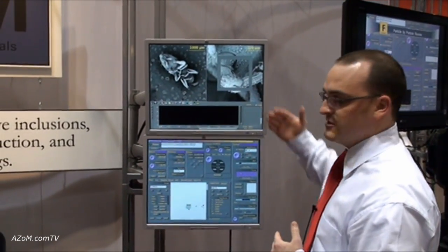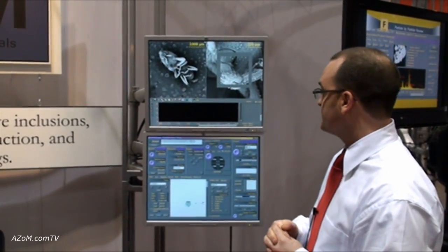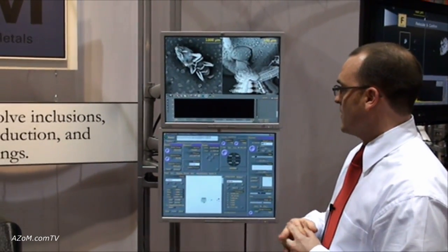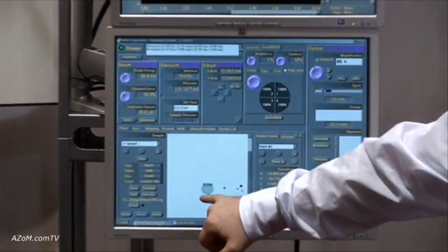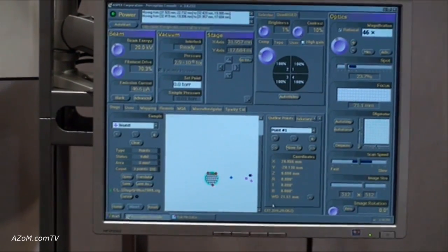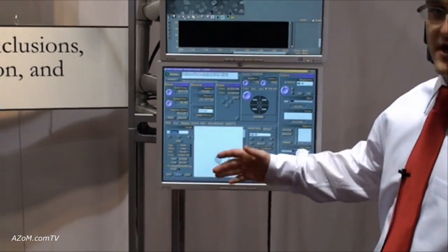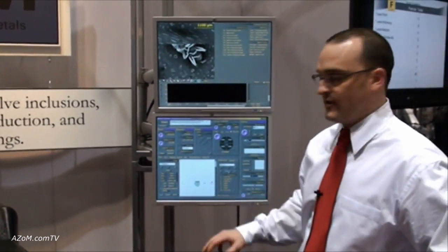We're illustrating some focusing capabilities and the usability of the software. Down at the bottom we have a stage movement tab showing several different sample locations inside the chamber. We currently have three different sample types, and we're going to move over to the particle sample to set up a quick automated analysis for quality control environments.